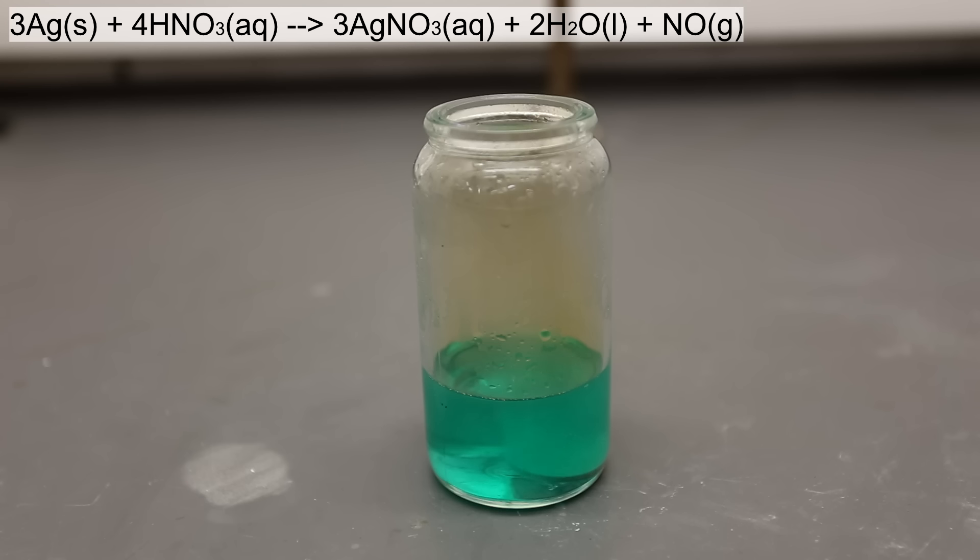The reaction that is occurring is shown above. Silver reacts differently in hot concentrated nitric acid than it does in cold or dilute nitric acid. As you can see in the equation above, nitric oxide is produced. Nitric oxide alone is extremely toxic and in the presence of air it produces nitrogen dioxide, which you can see as the brown fumes.